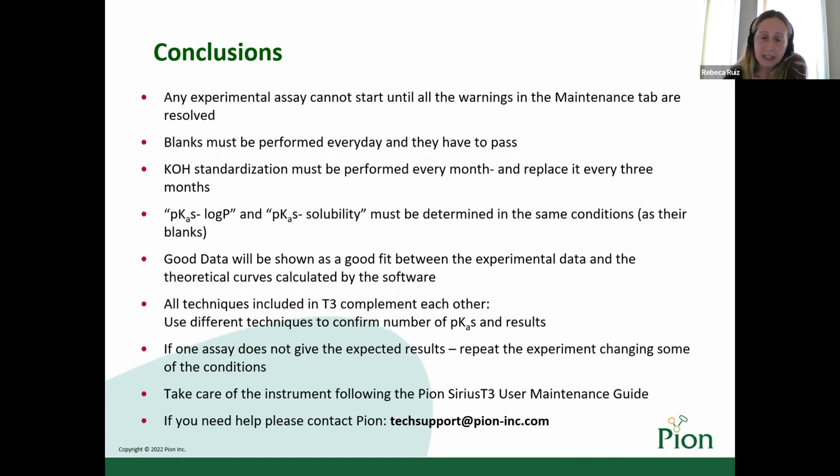Take care of the instrument, follow the Pion Sirius T3 user maintenance guide, and if you need any help, please contact Pion.